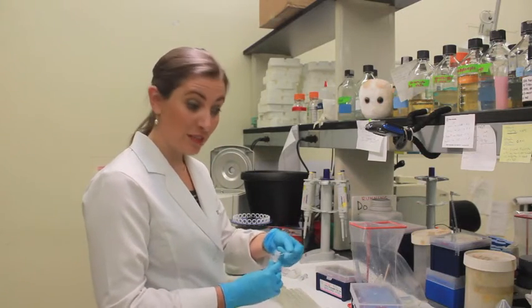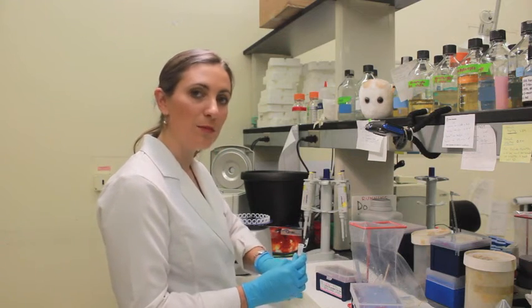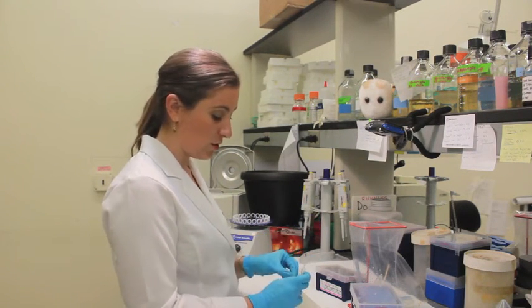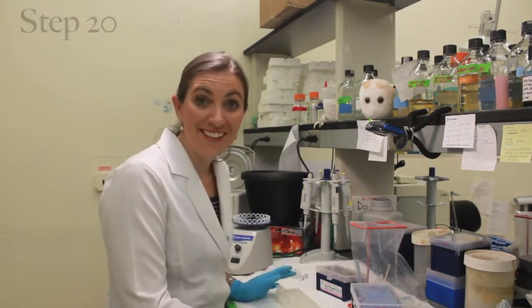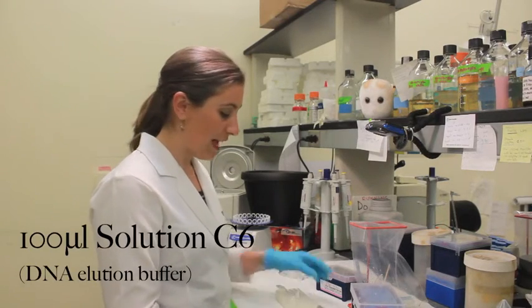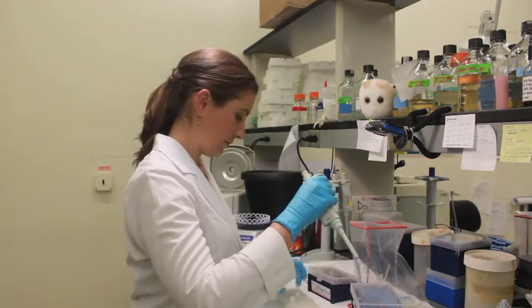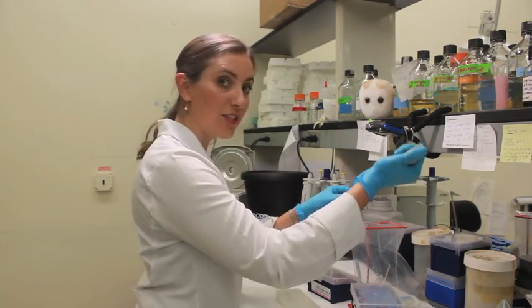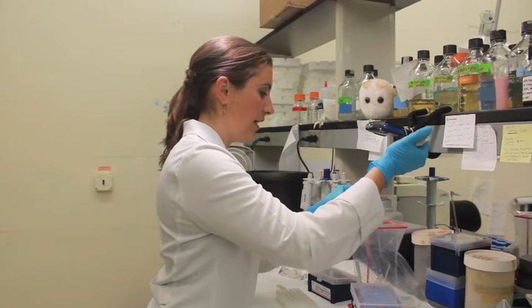We are almost done. Open it up and, just like we have been practicing, grab the spin filter by just the lip and transfer it to a new microcentrifuge tube. We are now at the final step. We are going to add 100 microliters of the last solution C6 onto our spin filter. While you are doing this, make sure that you are putting your tip very close to that membrane, but not actually touching the white part.